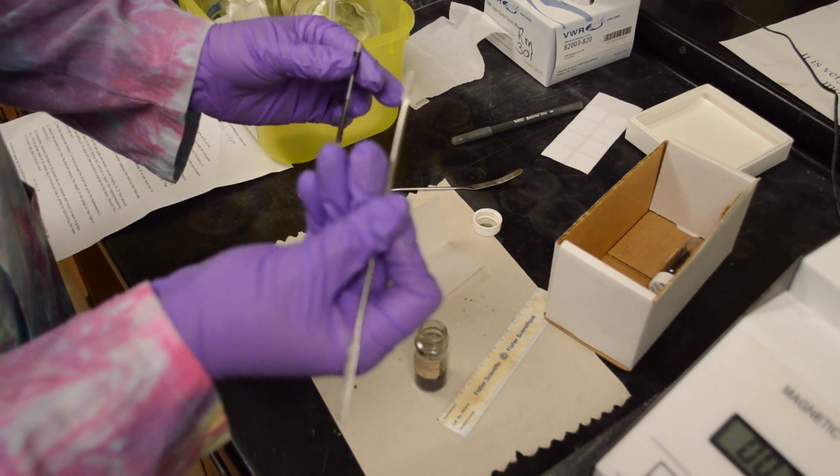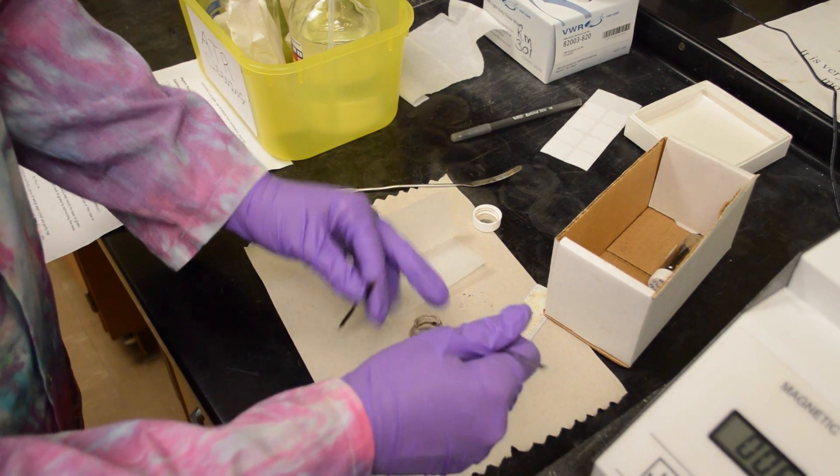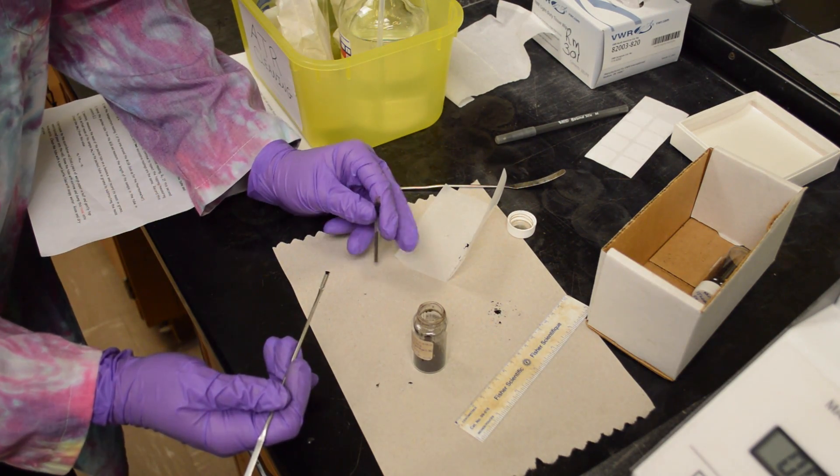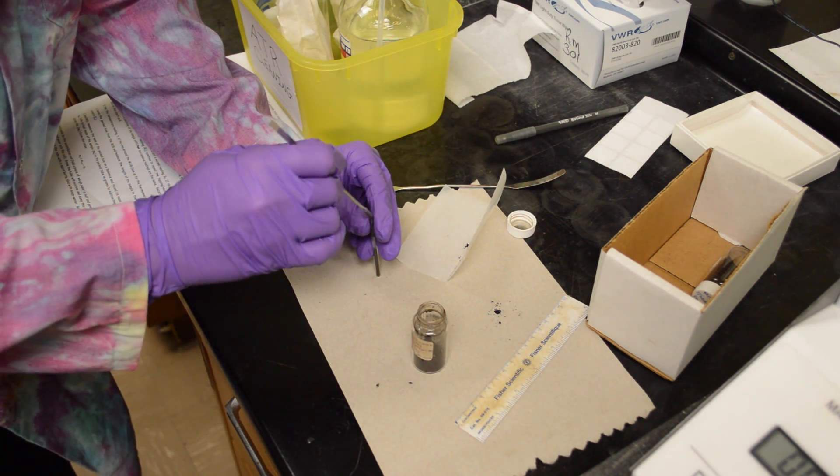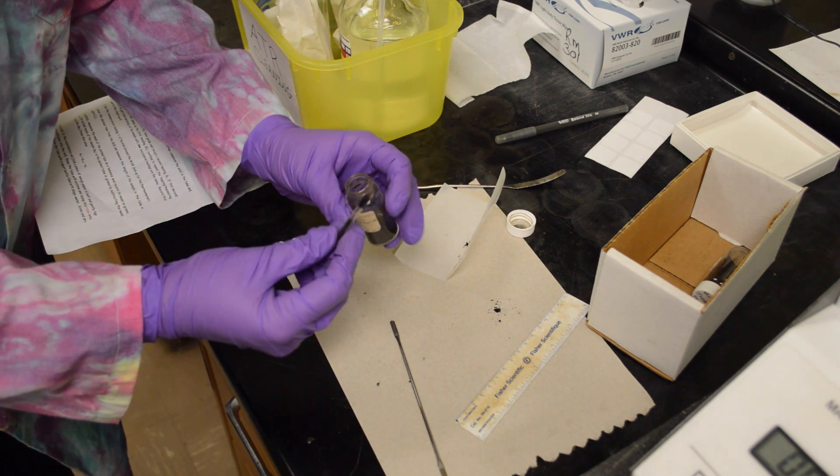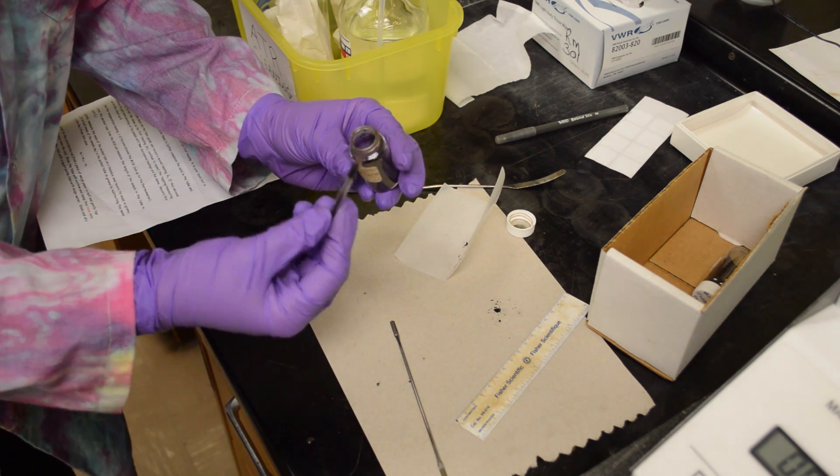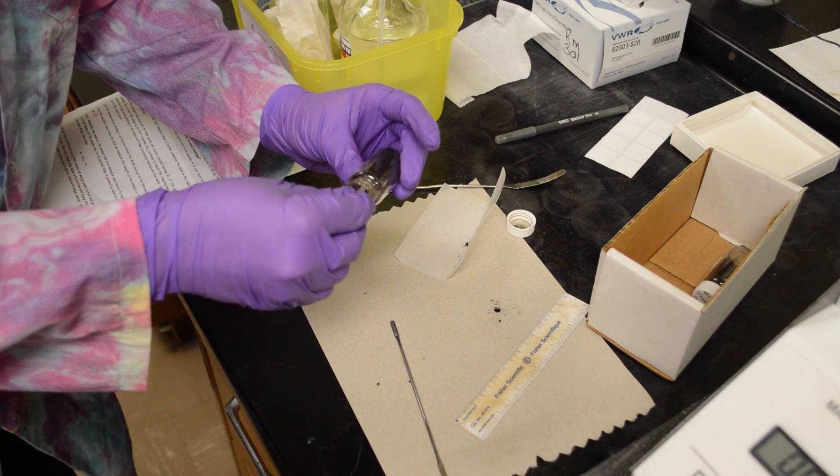We can use the scoopable end of the spatula here. Gather some of the sample and scoop it up on this little spatula and pour it in this way. Or you can use it like you would a capillary tube for meltemp and put the end into the sample vial and collect the sample that way.